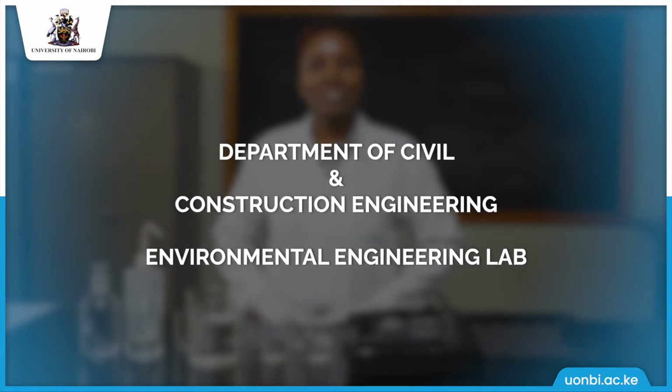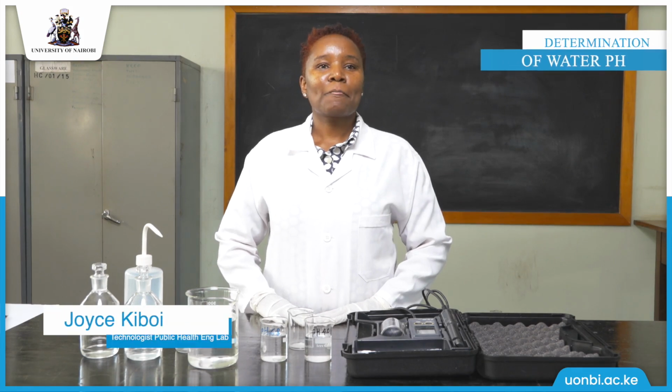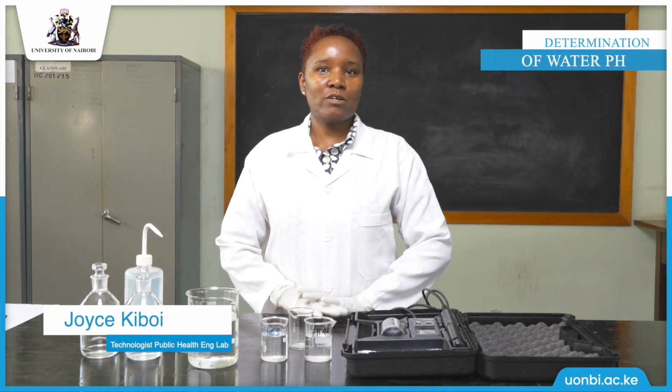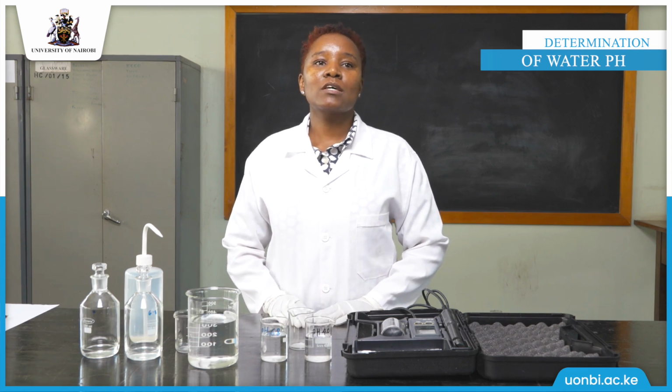Okay, my name is Joyce Kiboi. I'm a technologist in PHE lab. In this lab, we check the quality of water, drinking water, wastewater analysis, and treatment of water.